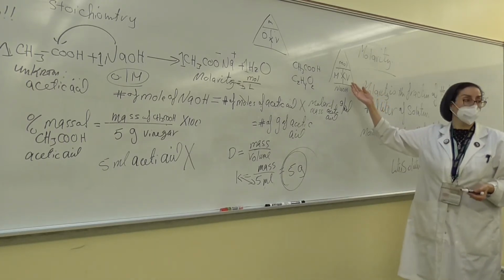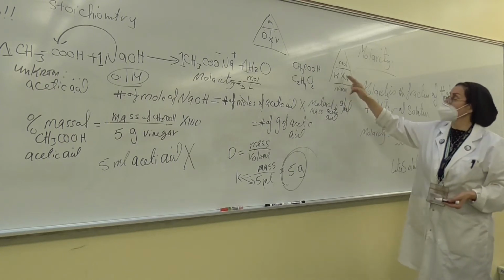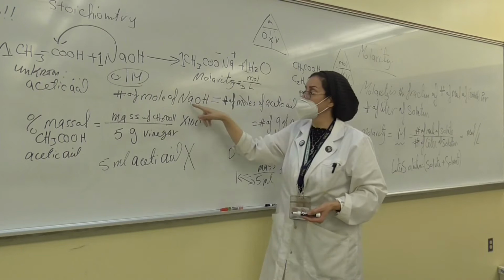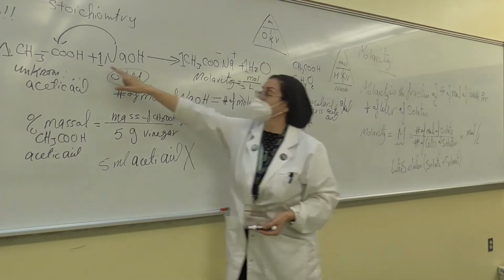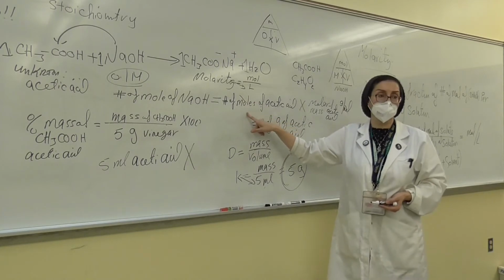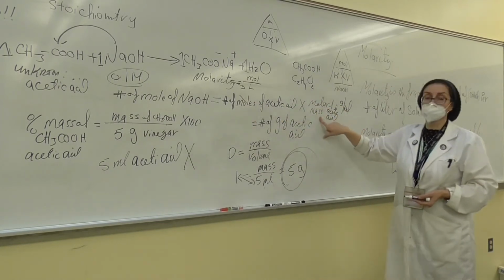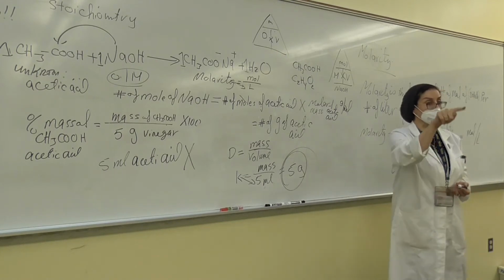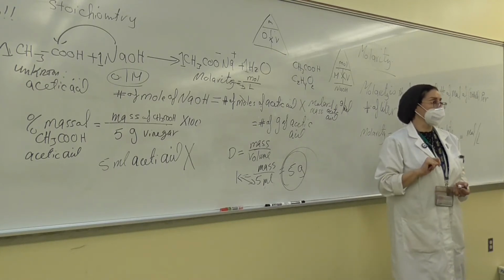So the volume also there. When you multiply the two, you will get the number of mole. That will give you the number of moles sodium hydroxide. Because it is 1-to-1 molar ratio, you will be able to find number of mole of acetic acid. Multiplying by the molar mass will give you the mass of acetic acid titrated with the sodium hydroxide.